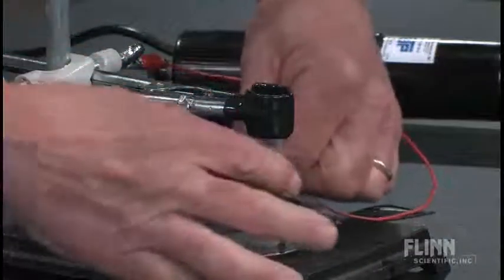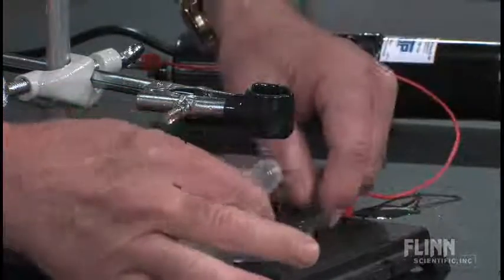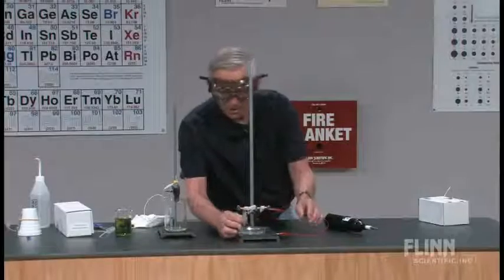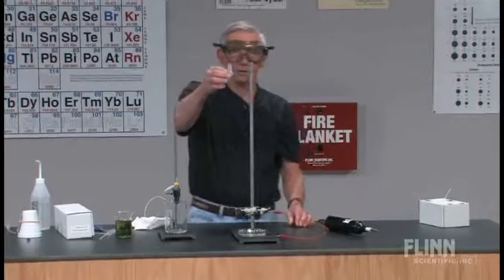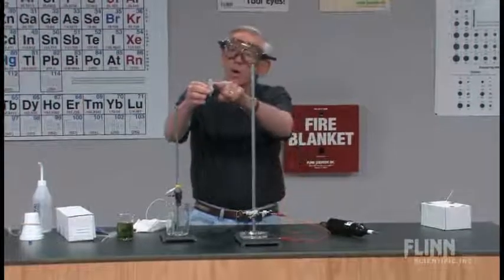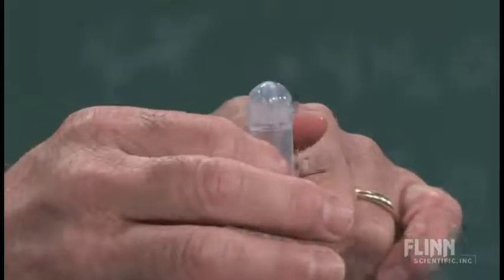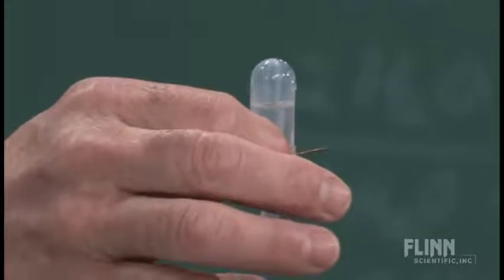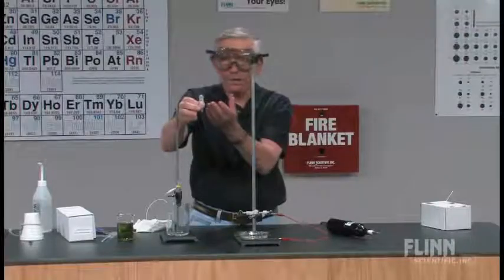At this point, I talked to the students about, what did you see? Well, it exploded. That's really cool. Do it again. What else do you see? There's the water level up here. But the explosion went this way. How did that water get in there?